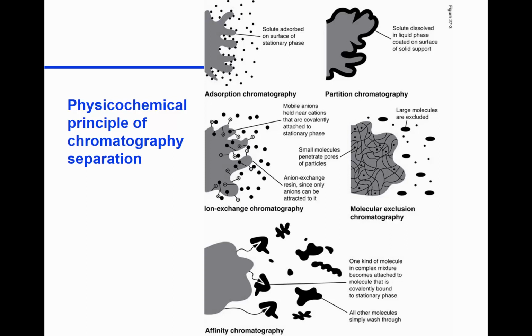You're not necessarily separating all the compounds in a mixture. You are selecting one. It's like when you're concentrating an enzyme or concentrating an antibody. You are really selecting one molecule.